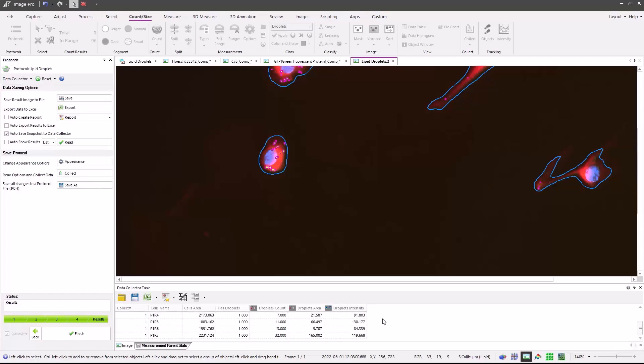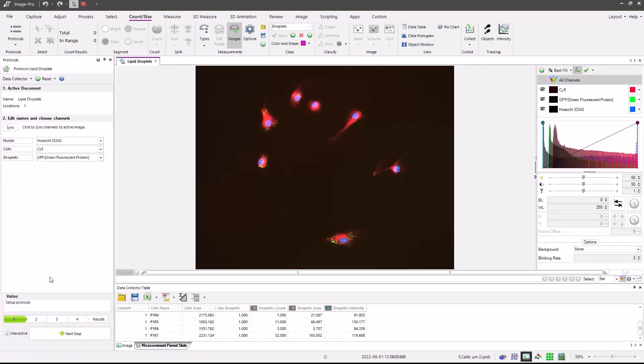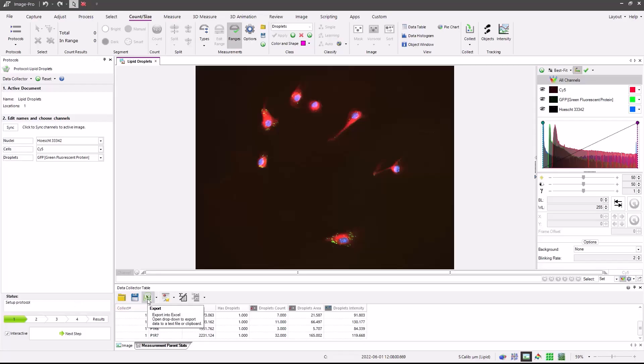If you've modified the protocol for your own images, you can press the Save As button, which will save a new protocol, and then you can recall that any time. Press the Finish button, and now we can analyze additional images, or if you have a folder of images or multiple plates, you can set up a batch process to analyze those images. Once done and completed, you can then export the data directly to Excel.